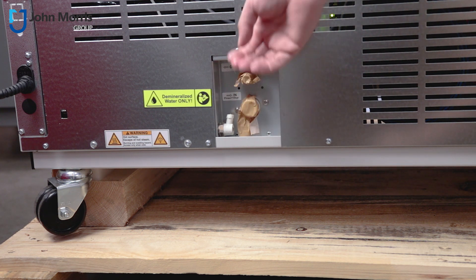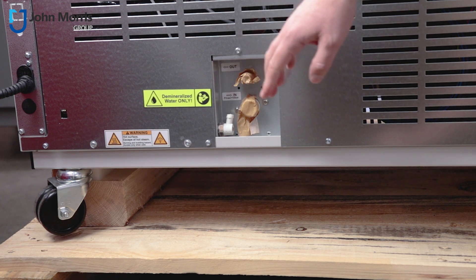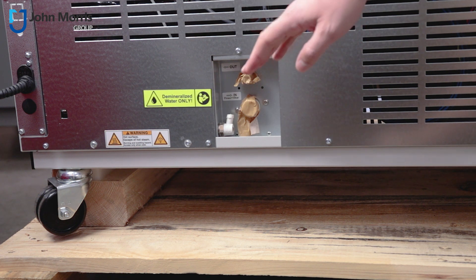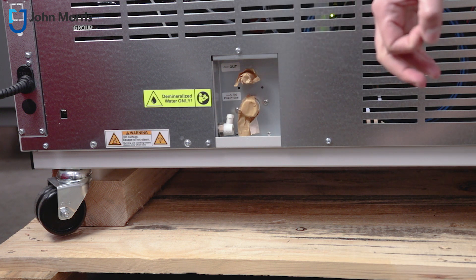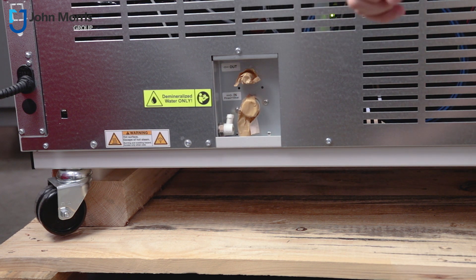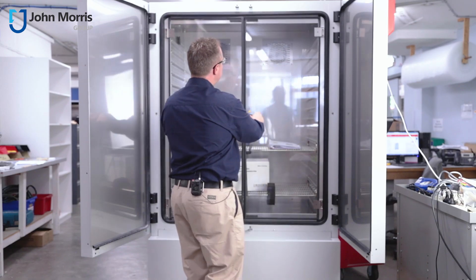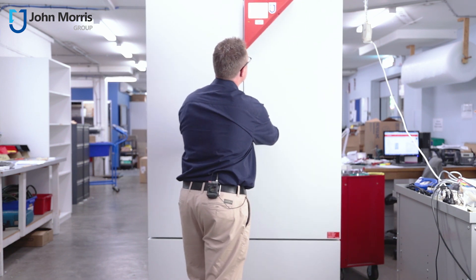You can see they've closed it off nicely so it's ready for shipping. There is a little bit of water here at the bottom — whilst that may seem unusual, I really like that. It means they've actually tested every single feature of this unit before they've shipped it. Judging by the small amount of water, it's clearly been drained already before shipping, which is perfect. The unit has tight sealing double doors, and this is ESG safety glass.